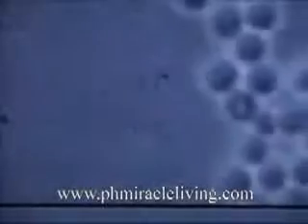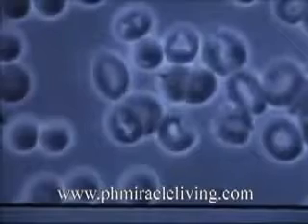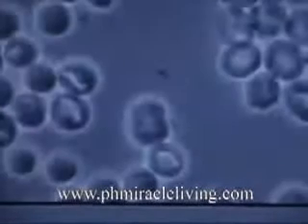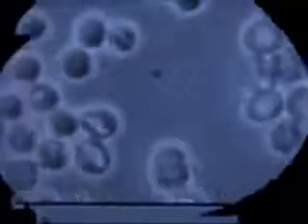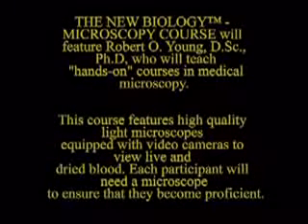This right here is a heterogeneous symplast, a combination of various bacteria, yeast, and other acidic toxins in an aggregation or a city. In fact, I refer to it as a city of garbage. Very common in diets that are high in proteins. More diabetic cells or fermenting red blood cells, very typical in diabetics, particularly type 1 diabetics.